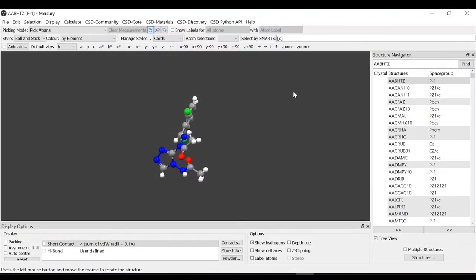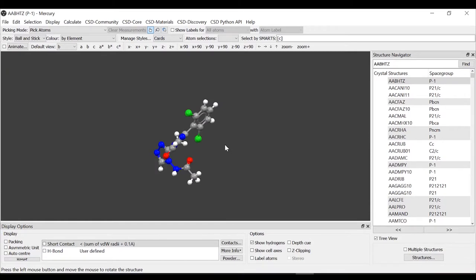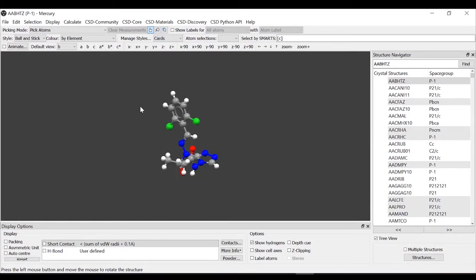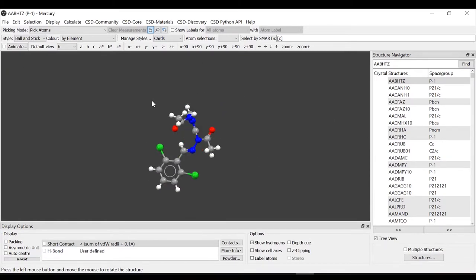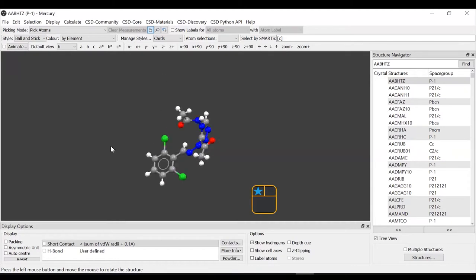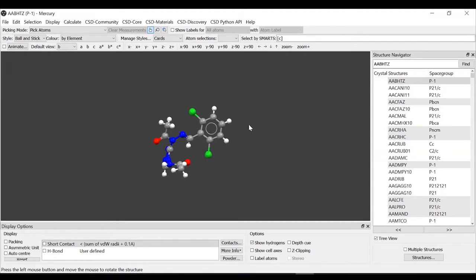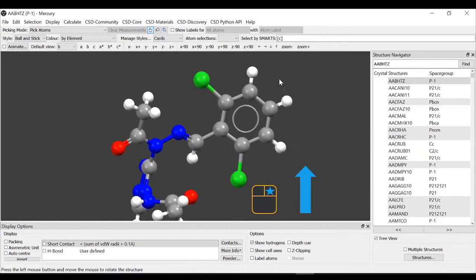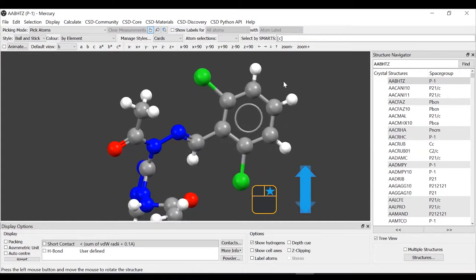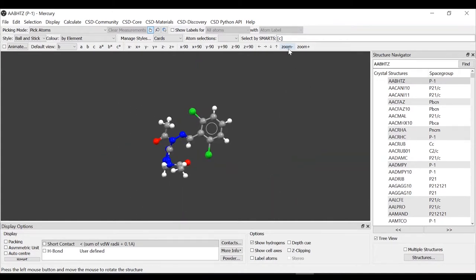First, let's have a quick look at the Mercury interface. We have the display, the 3D viewer in the center with our molecule. I'm moving it by clicking and dragging. If I want to zoom in, I usually right click and move up or down, but alternatively you can use the zoom plus and zoom minus options at the top here.